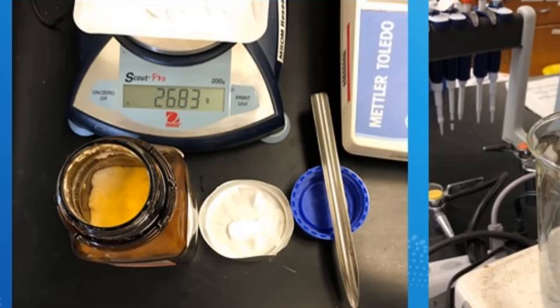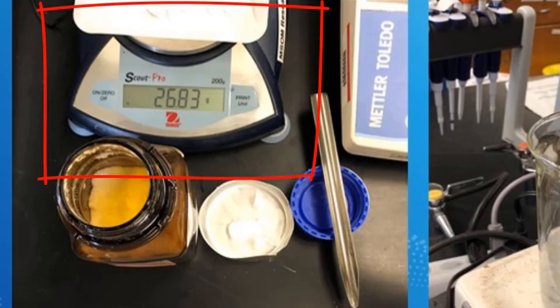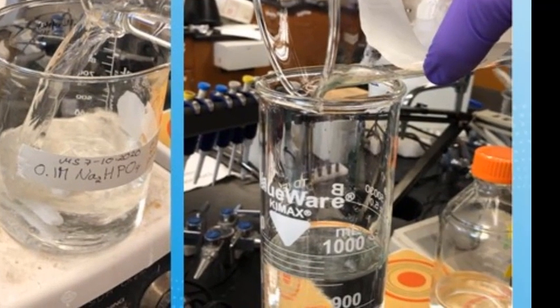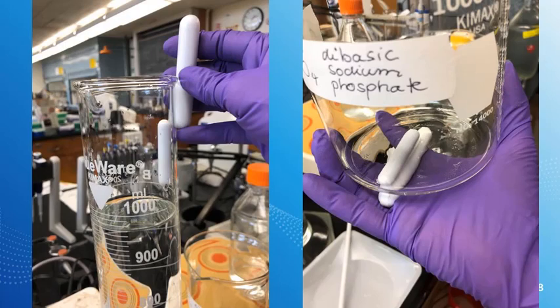To make a stock solution for a buffer preparation, it is typically sufficient to use a top loading scale. To dissolve the solid component, use a large beaker that's better to stir than a narrow cylinder. And don't use all the water at once, leave some room to fill up to the final volume. Here is an example on how to avoid the retrieval of a stir bar. Just hold your glass container with a large stir bar.